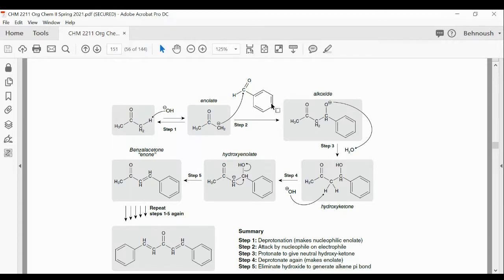This carbon-carbon double bond is attached to another double bond and then another double bond. Alternate double bond, single bond, double bond, single bond, double bond, single bond, double bond. This is known as conjugation. What happens when you have conjugation? The location of the peak for the CO double bond is going to decrease. So it goes from 1700 to 1680, or the range of 1700 to 1715, it would go to 1680 to 1700. So it would be lower.